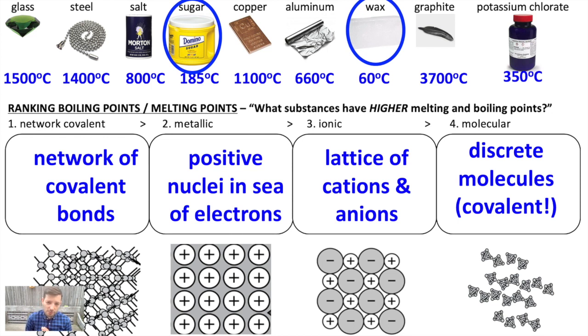Okay, so this video was meant to introduce you to some of the techniques that chemists use to separate and then more importantly identify different substances. We can test them with different chemical tests. We can investigate their physical properties, solubility, melting temperature. And we can use that information usually in combination with each other to start to figure out what kinds of properties a substance has. Is it acidic? Is it water soluble? Is it relatively low melting? Okay, we could just use those 3 tests we just talked about today to answer that. Moving forward, we're going to look at analytical tests, some really modern techniques that we can actually use to combine with these and decipher what the structure of a substance is.